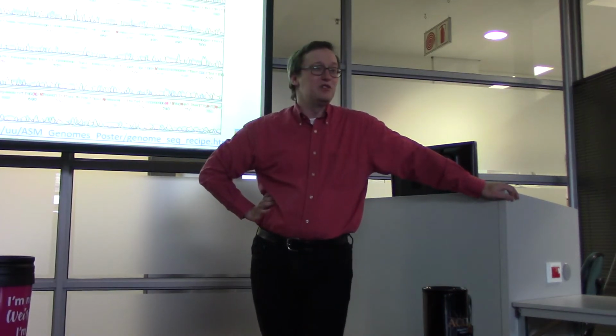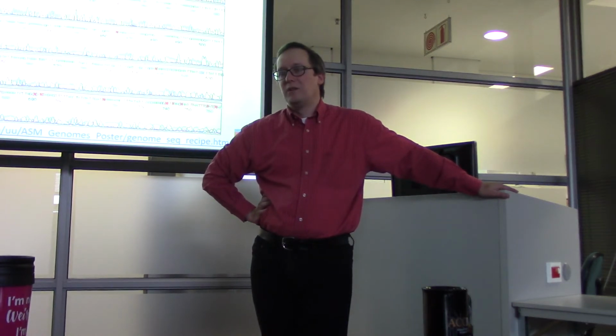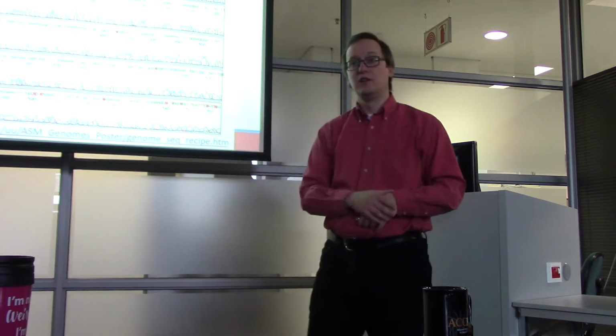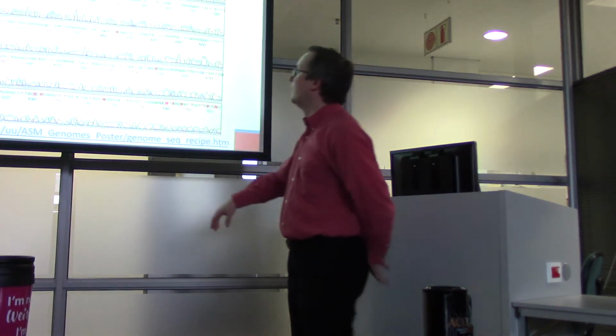In the days of the Human Genome Project in the late 1990s, people would really have liked having this kind of instrument around. Today, it would kind of be stuck in an embarrassed corner of the sequencing lab. And so what I'm showing you is an electropherogram produced from a Sanger sequencer. So one of the old school capillary electrophoresis, fluorescence, and 4-channel stuff going on here.